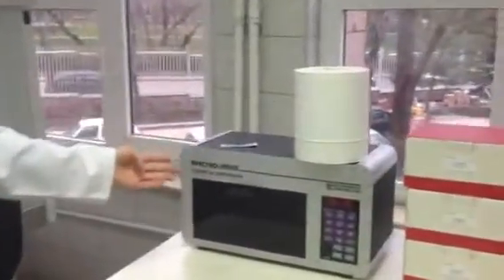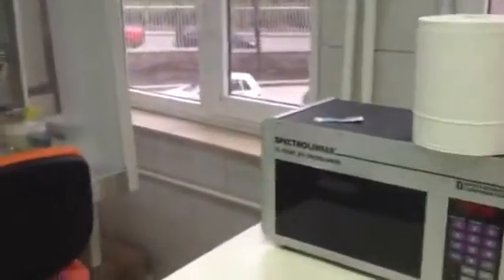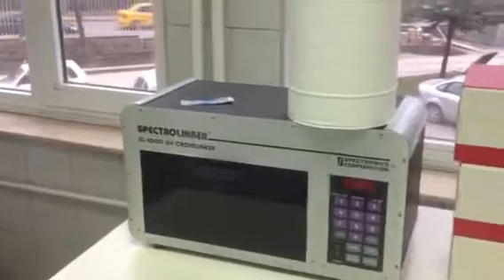For example, the RFLP machines: a hybridization cooker, a spectrolinker, also called a crosslinker or UV crosslinker, and an ultra pure water machine.